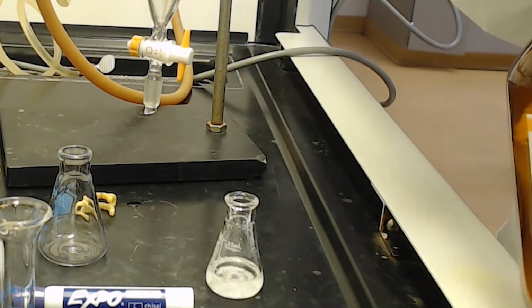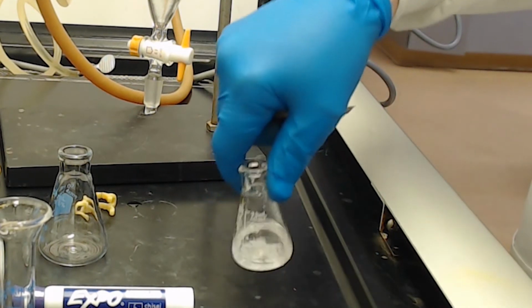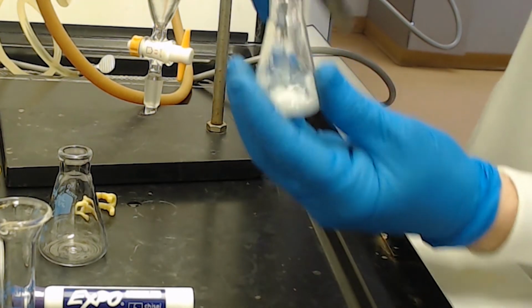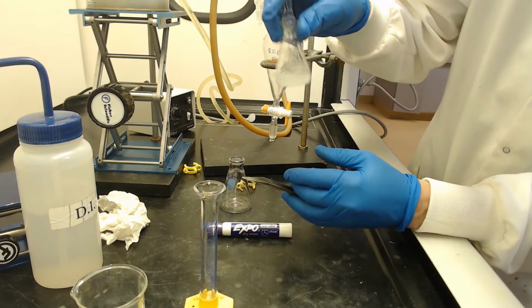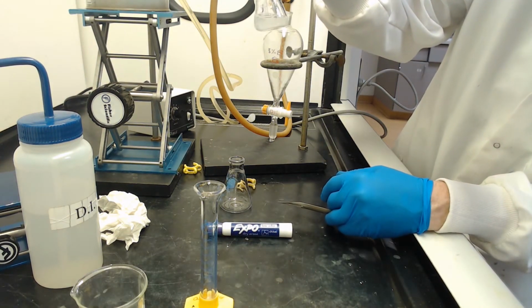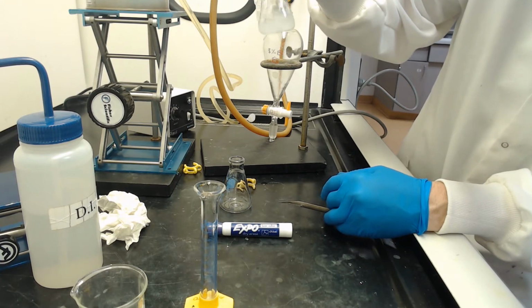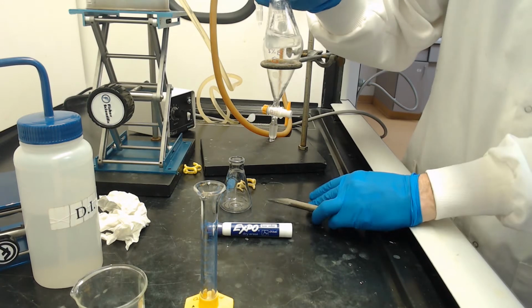And again, what we're critically looking for here is to make sure that you don't see some of it clumping up. Think of it as the snow globe. So is that snow globey? It gets all powdered up and dissipates, and you can see now the solution's getting real clear. So it takes some time.